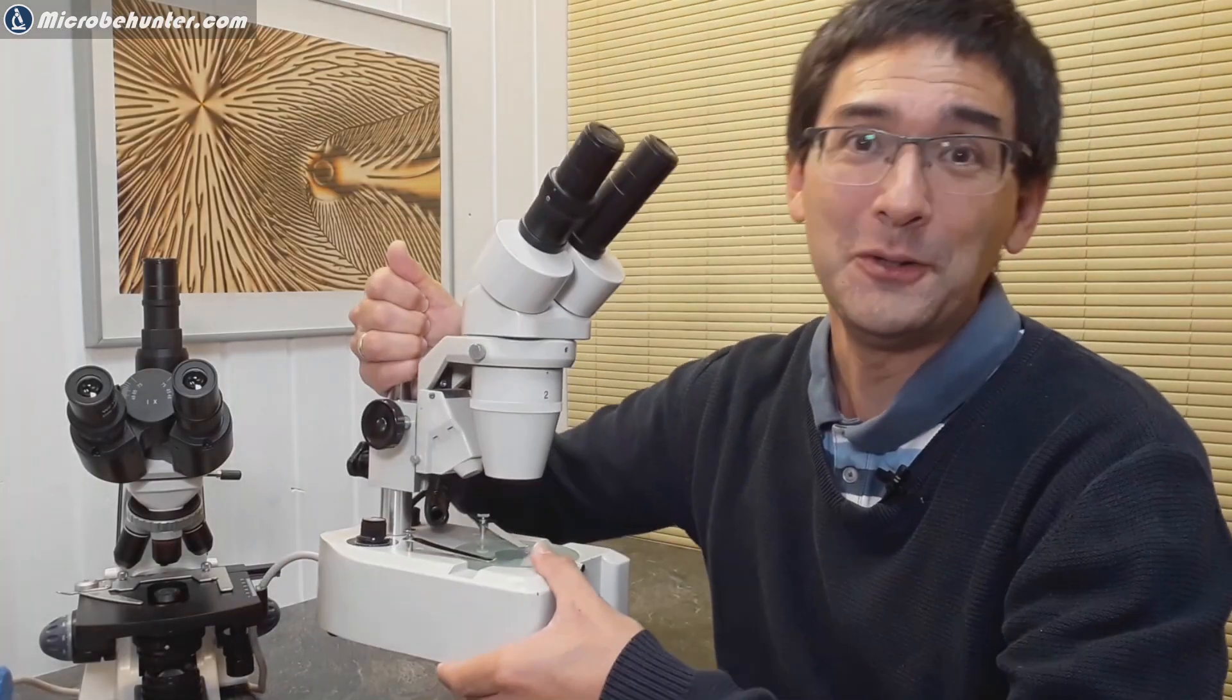Then I have a totally different recommendation to advance your hobby and that recommendation is, well, get yourself a stereo microscope. Honestly they do not cost that much and actually this really does advance your hobby because now you can actually look at different specimens, opaque specimens, and it opens up a different world for you. You can look at the things in a three-dimensional way.